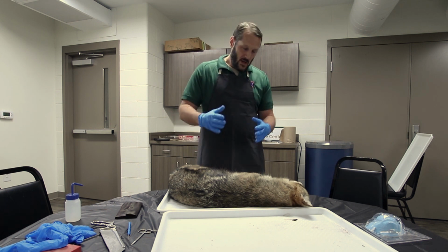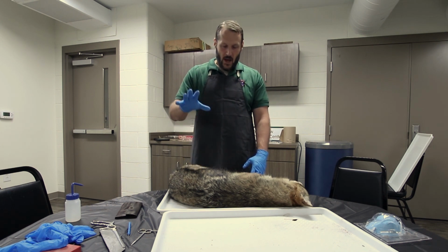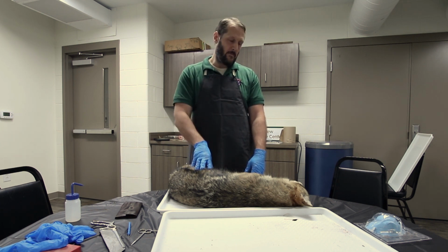As promised, here is a new dissection. Last time we took you through the dissection of a classic reptile. It was a black rat snake. Today, we are going to dissect this coyote right here and see what makes it tick.